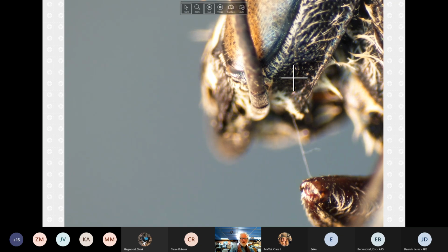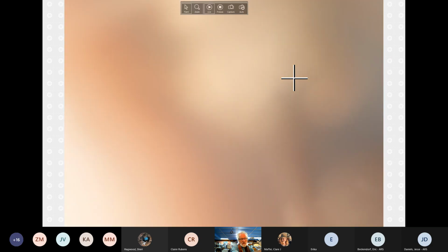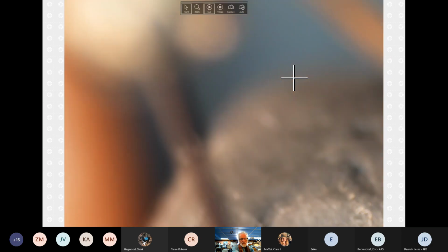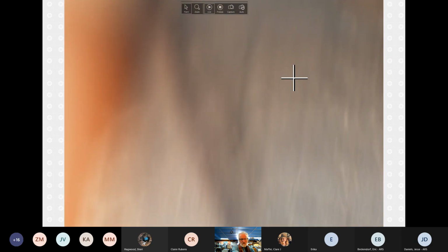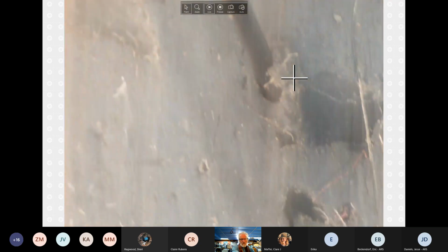Okay, so now let's concentrate, and I think we're going to go to the head again, probably for alternatus versus hunteri, because we have the donut-shaped swellings on here. Oops, that's the base of the pen.